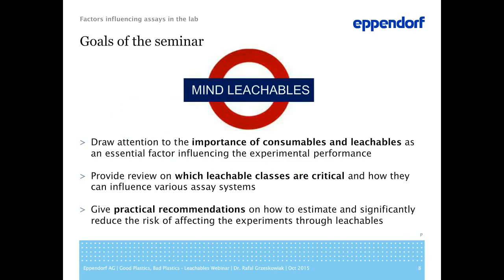And basically, this is the scope of this webinar. So let's recapitulate here the main messages or goals of this seminar. I would like to draw your attention to the importance of consumables and leachables as crucial factors influencing your experiments.